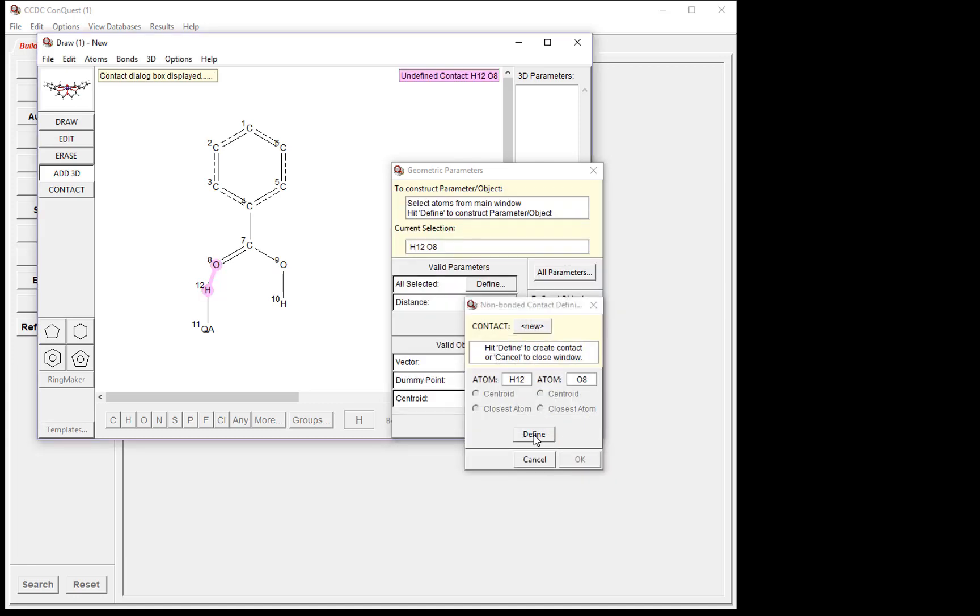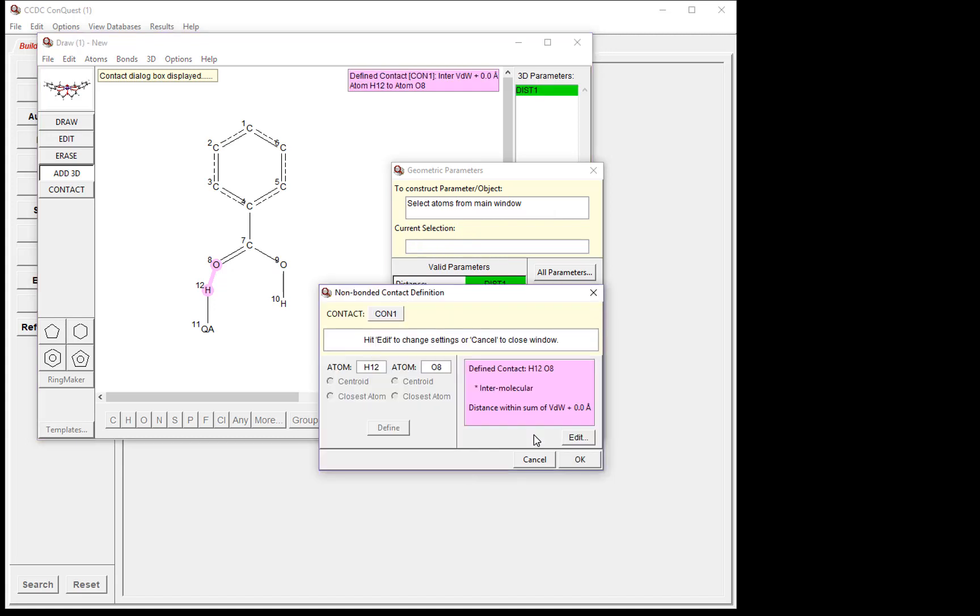We want to define the contact, so we click Define. This window gives us the opportunity to edit our definition of this contact, but we will stick with the default, which is the distance within the sum of the van der Waals radius. Click OK.